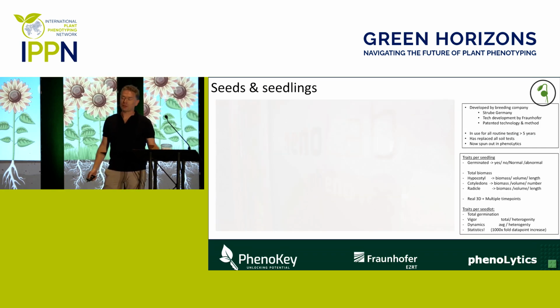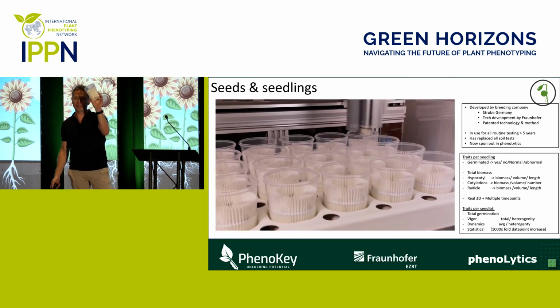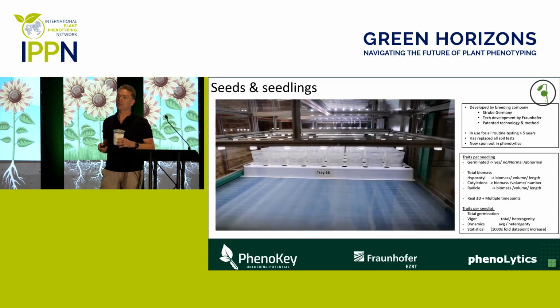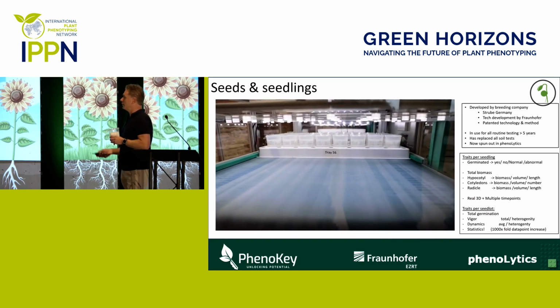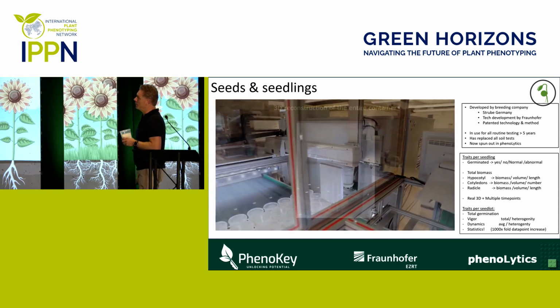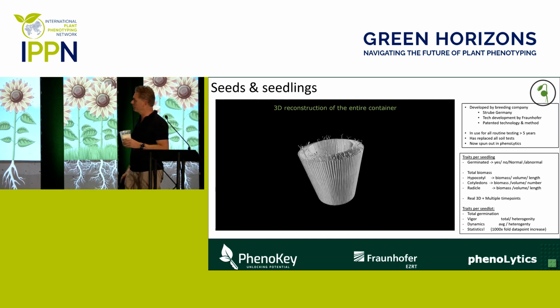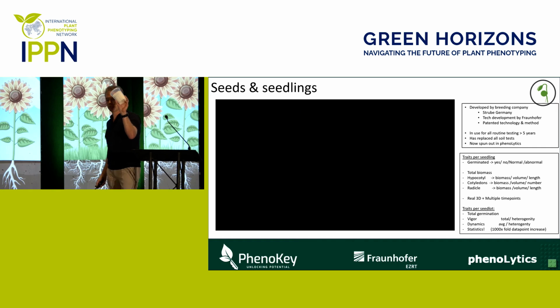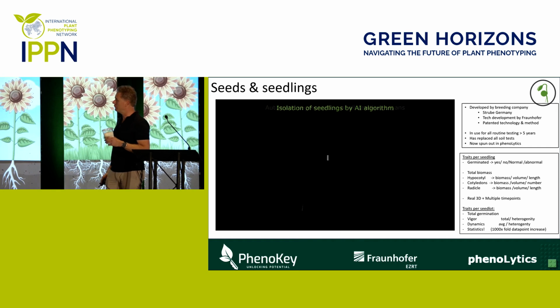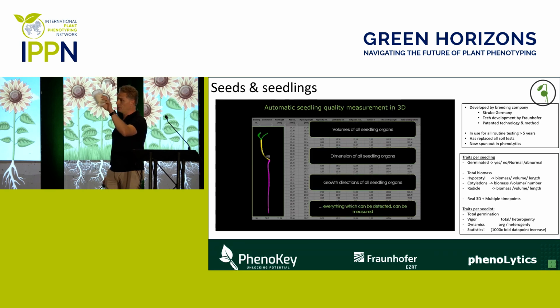So there's a new method available, and that all revolves literally around this pot. That has been developed in a breeding company, together with Fraunhofer Institute, and that's what you will see in the next minute. So this is a fully automated concept of automating the germination trials in vertical pleated filter paper. This pot contains 50 seeds, and that will be automatically imaged using an X-ray CT scanner that you see here in view. All the images are acquired and a 3D reconstruction is made, all within the pot, without opening the pot.